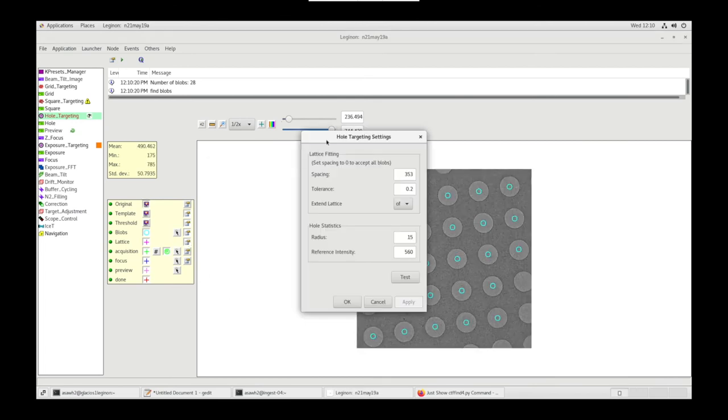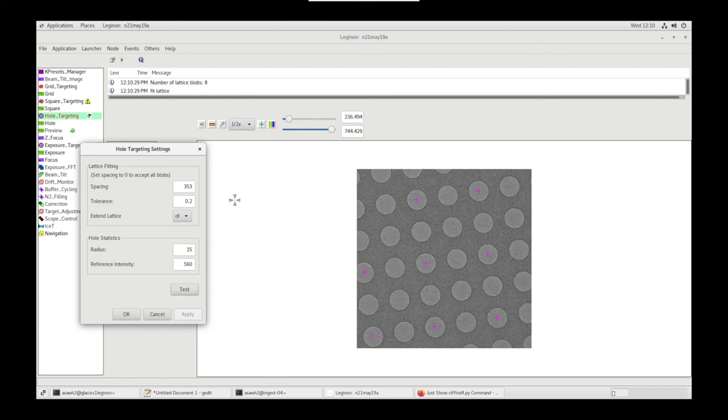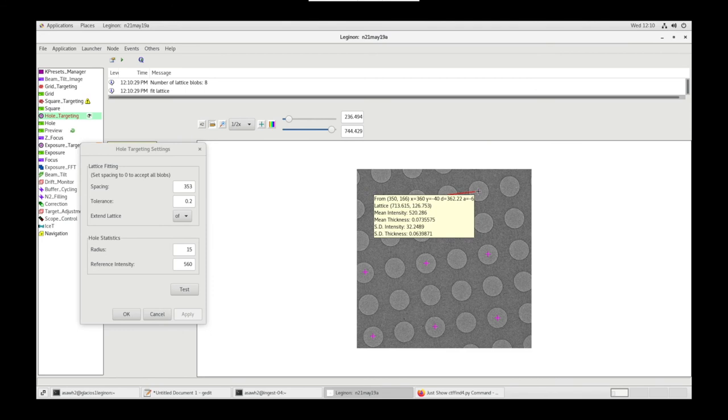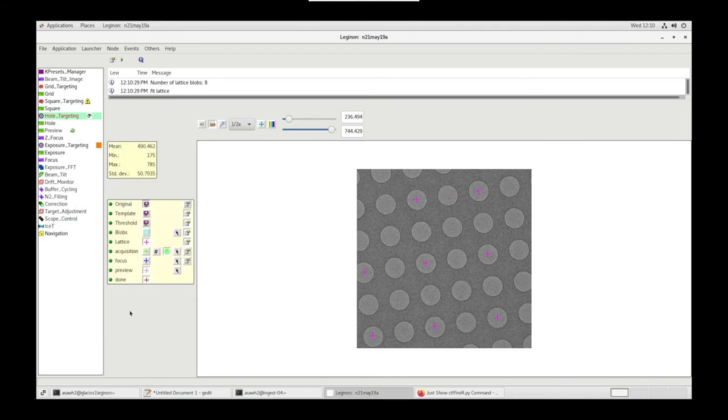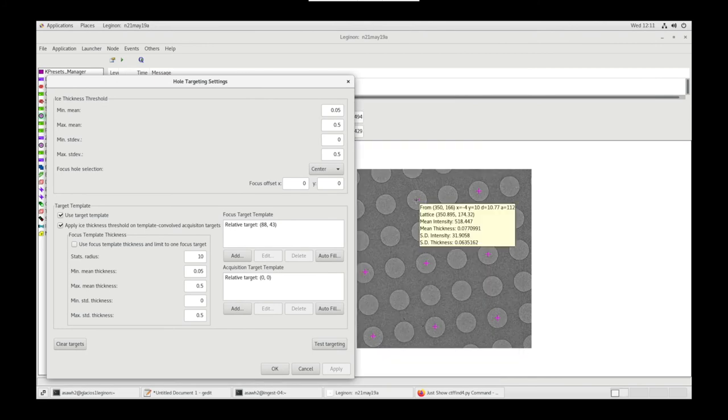Let's go to Lattice Settings. Test. You can use the Ruler tool to measure lattice to lattice, and you can change this number in spacing. Let's go to Acquisition Settings.